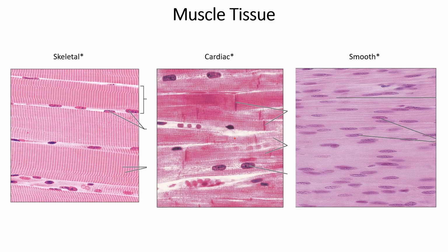Those are your muscle cells. When we talk about the muscular system, we'll talk about how muscle cells are fiber shaped. They're elongated and not your typical shape of what you would consider a cell, right? So we clearly see the elongated fiber shapes of the cells for skeletal muscle and for cardiac muscle.